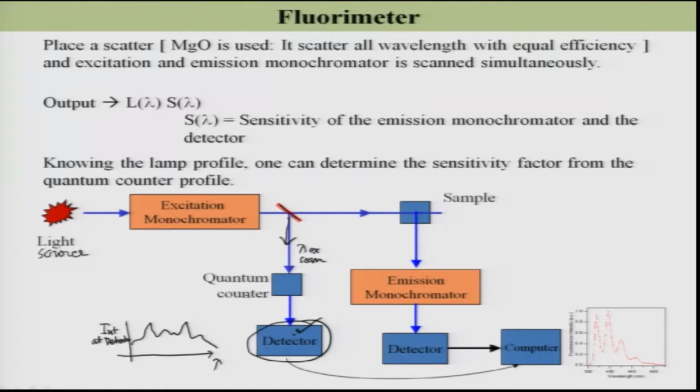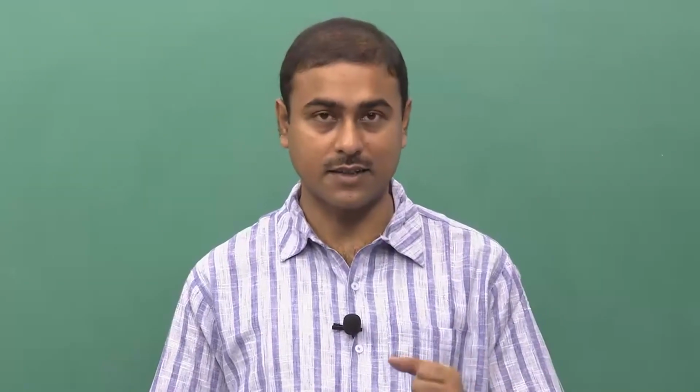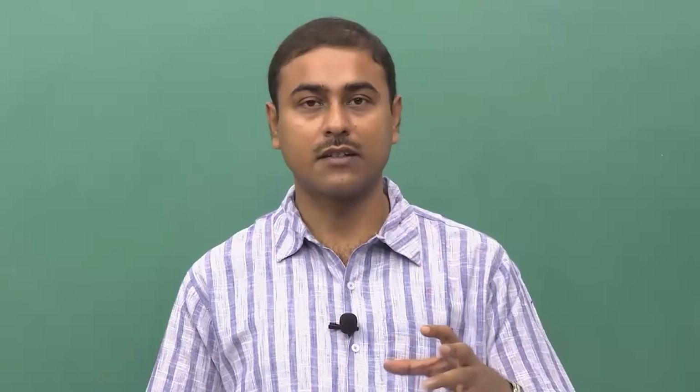And then I was discussing the measurement of the total emission coming out from a substance where the inner filter effect is highest, the complete inner filter effect. So, no excitation light is passing through the sample. The whole excitation light is being absorbed by the sample, the concentration is so high, and we are going to collect the total emission spectra coming out of this sample, right.